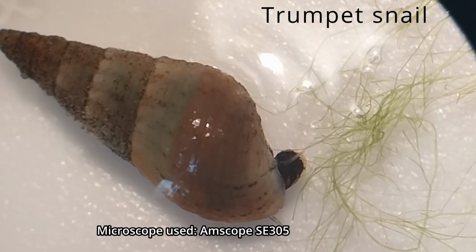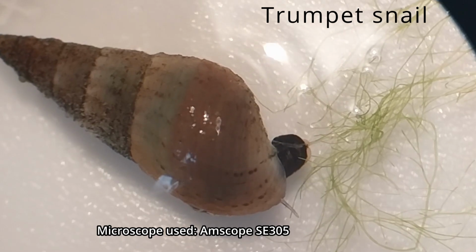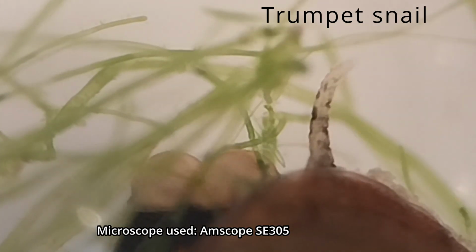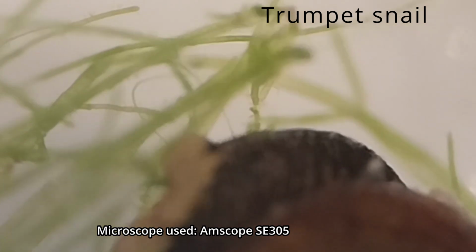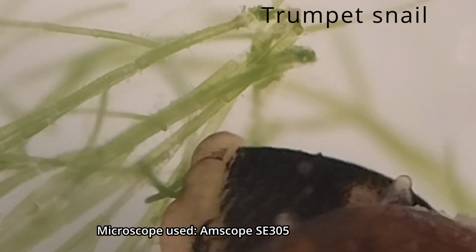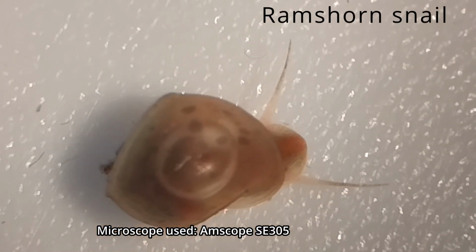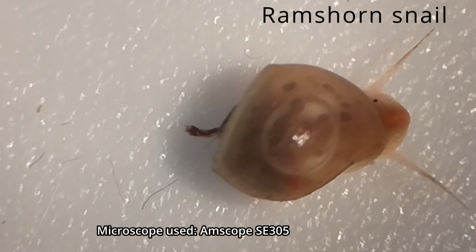Back to snails. This trumpet snail is eating some macroalgae. This other video also shows a trumpet snail eating macroalgae, but at a much higher magnification, meaning we can see the snail eating up close. But also, we can see that the snail eats using a tongue-like structure known as a radula. This is another snail. While I am not certain of its identification, it may be a ram's horn snail. I think so because of the shape of its shell.